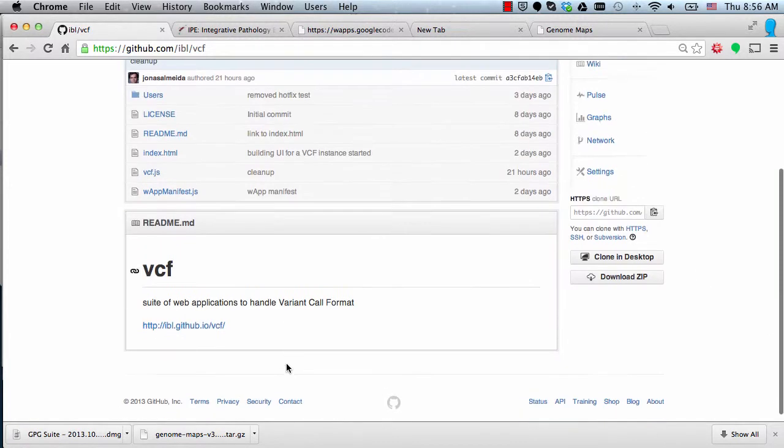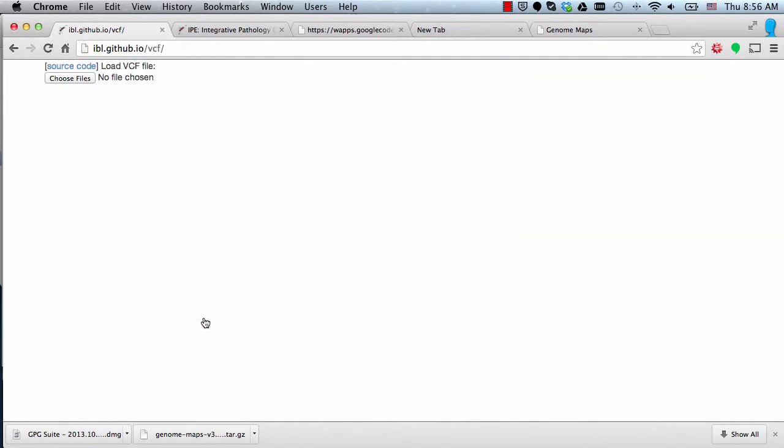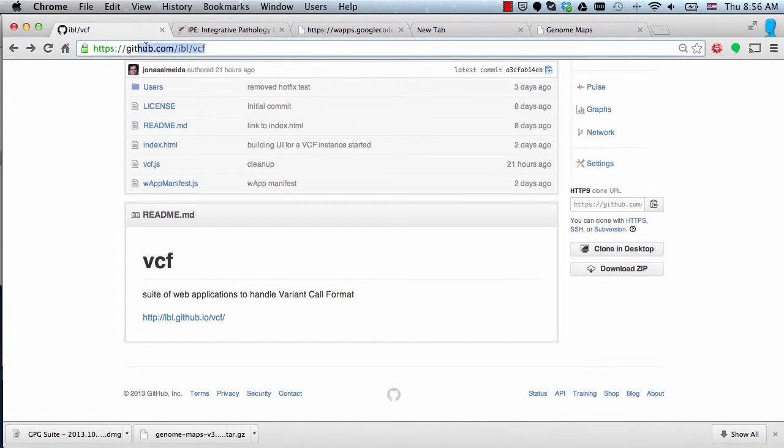The first version, or at least the foundations for the VCF tool, are ready, and I want to show it to you. I guess we should meet later, so you can tell me about some of the features we are considering for the next steps.